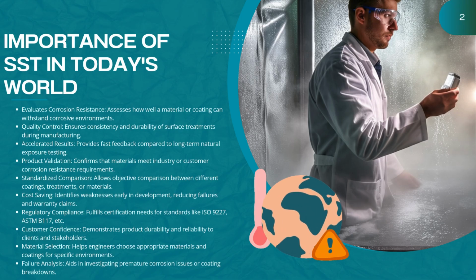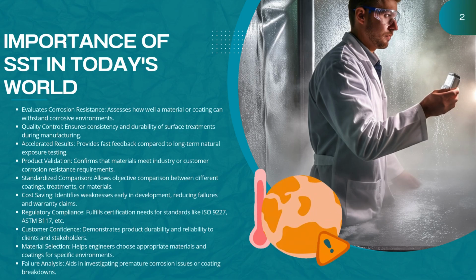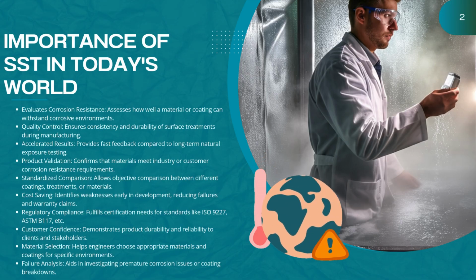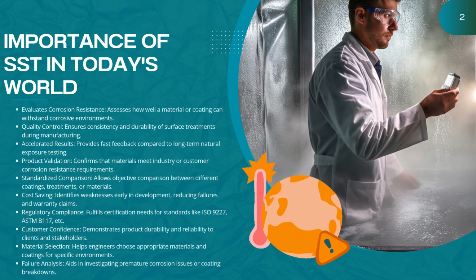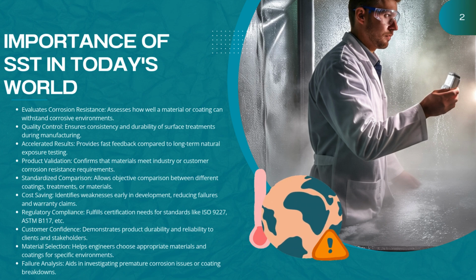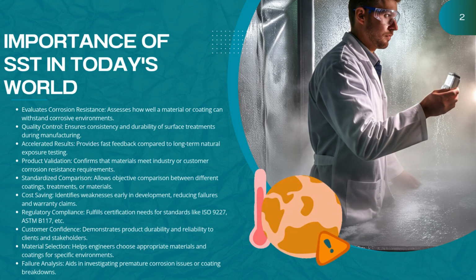It's also a reliable way to compare materials, choose the right coating, and even build customer trust by proving a product's durability. So SST isn't just a lab test, it's a key part of smarter design, safer products, and longer-lasting performance.